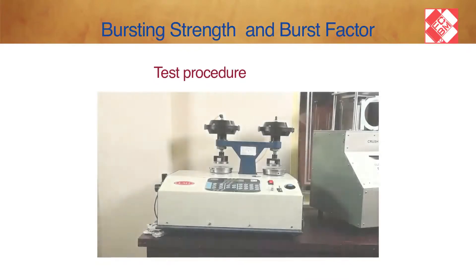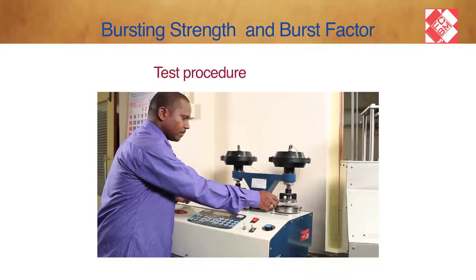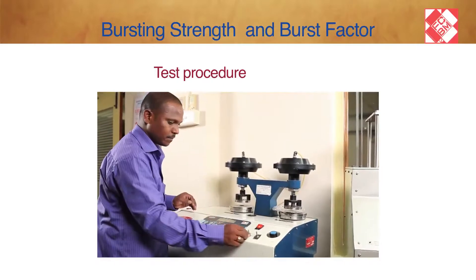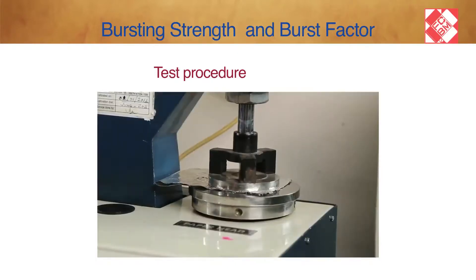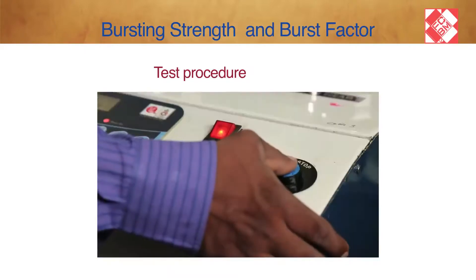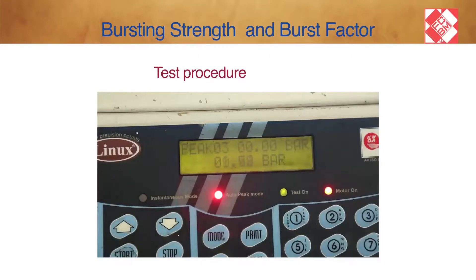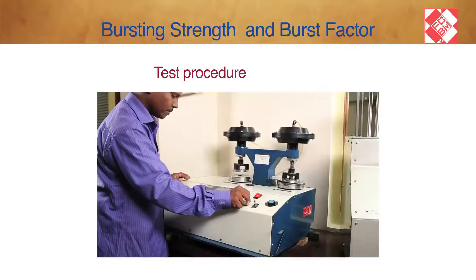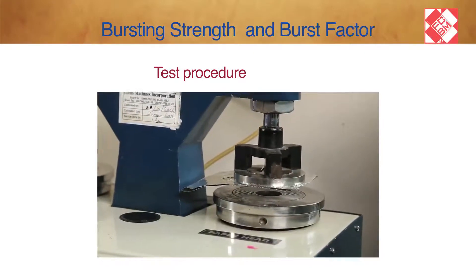Test Procedure: Place the sample to be tested over the diaphragm plate. Lower the clamping plate by pressing the button down. The first test on a new sample should always be done with the gauge of greater range — 0 to 120 pounds per square inch.